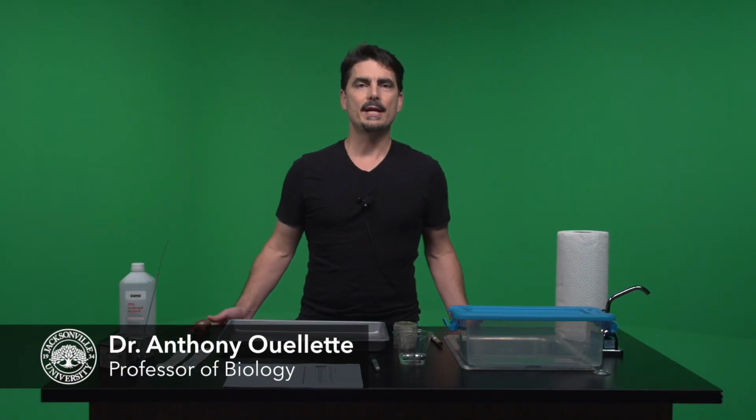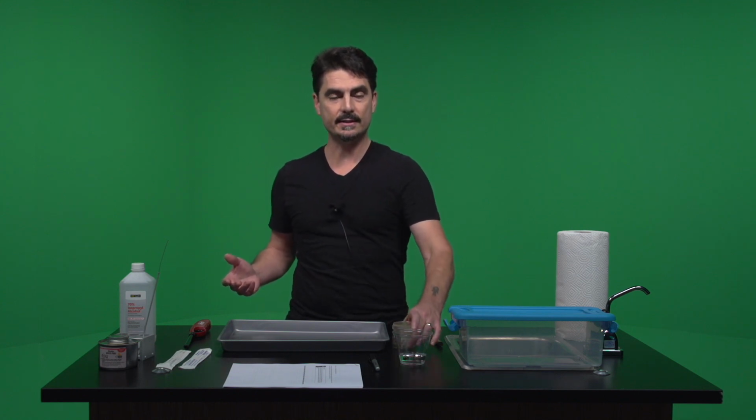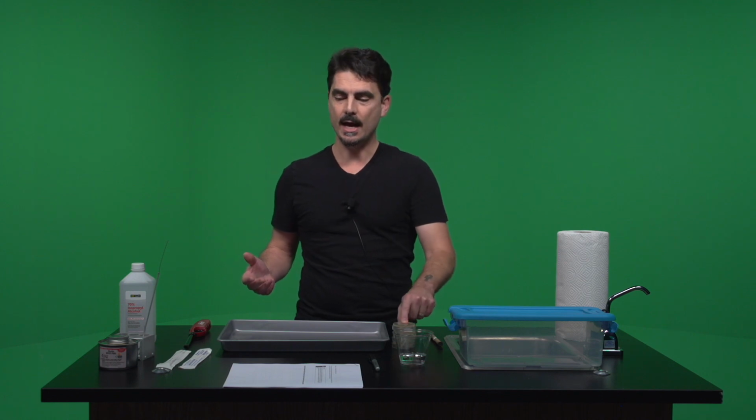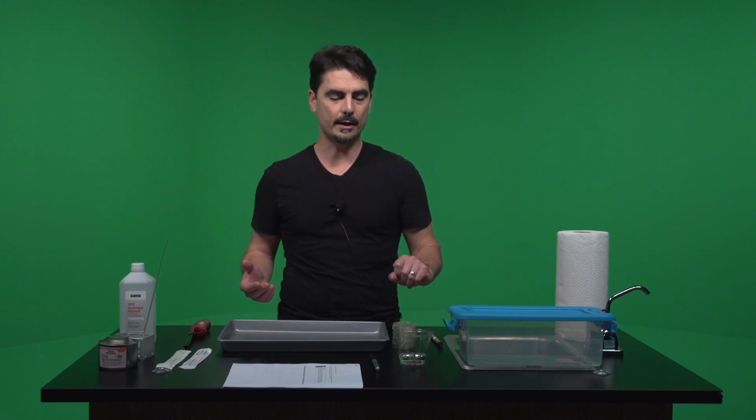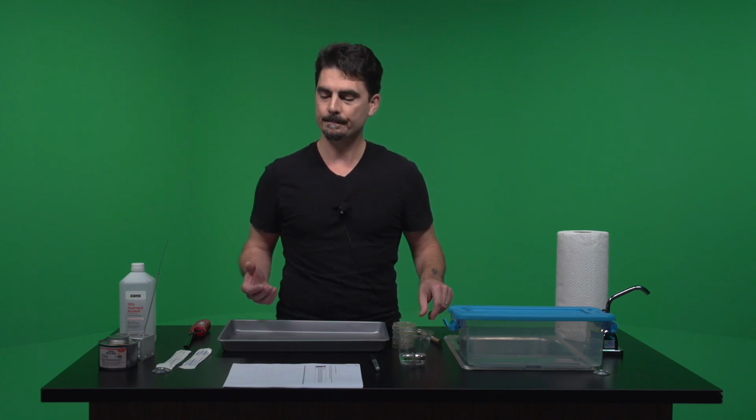So let's get going on this Ubiquity of Microorganisms lab. First things first, you always want to make sure that you have everything you need. So I have the 4 TSA plates that were prepared. I have distilled water that I just poured into this cup, the incubation chamber, the thermometer.